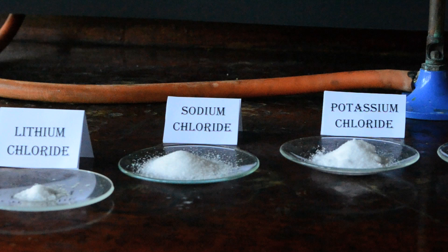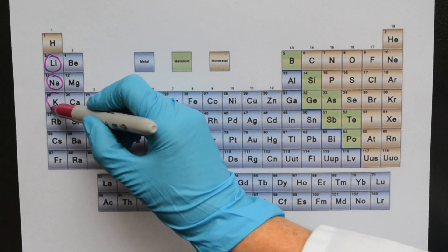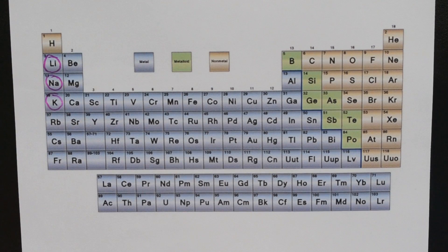Lithium chloride is a member of the alkali metals and it is white in colour. It's hygroscopic, which means it absorbs moisture from the atmosphere, so immediately you start seeing droplets on the clock glass. Sodium chloride, which is common table salt, and potassium chloride are also members of the alkali metals and they all exhibit white colours in their solid state.